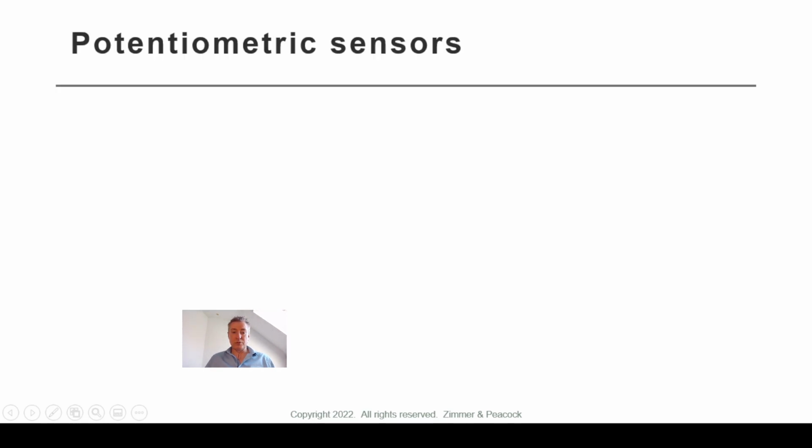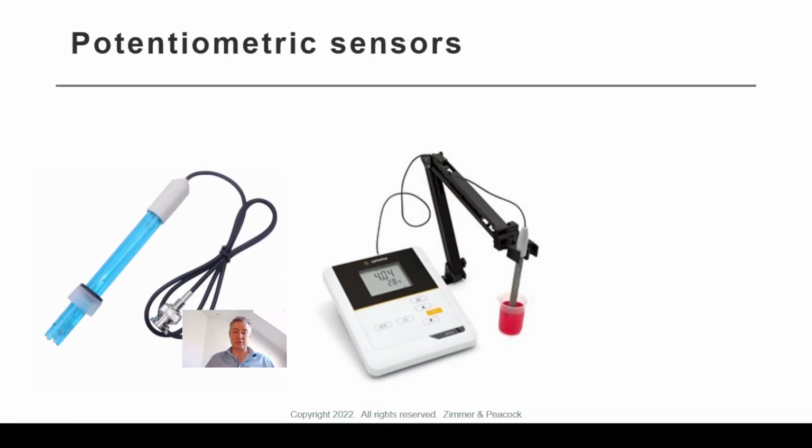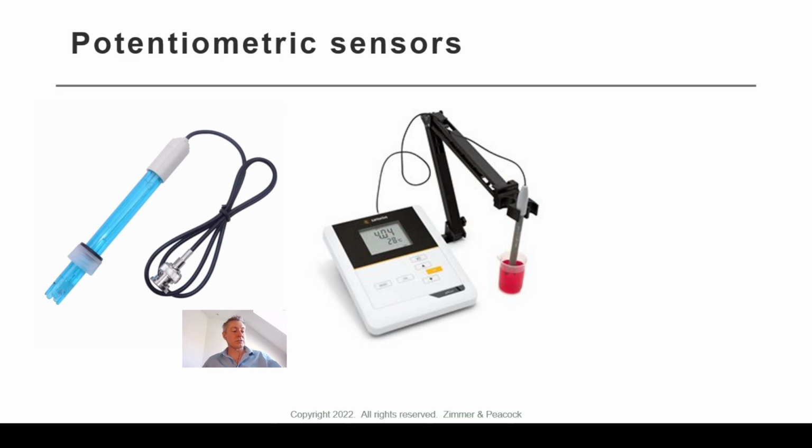And before you say, no, I've not heard of ion-selective electrodes, there's just about no scientist, be it a biologist, a material scientist, a chemist, a practical physicist, everyone at some point may have used a pH meter. The world has gotten a lot more modern, and so we are able to measure ion-selective electrodes.